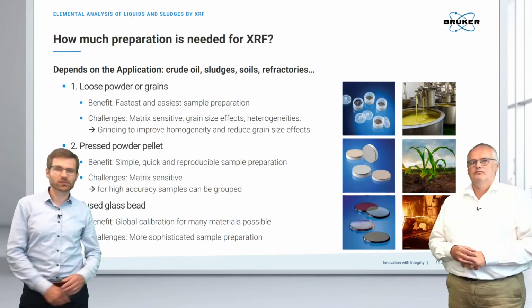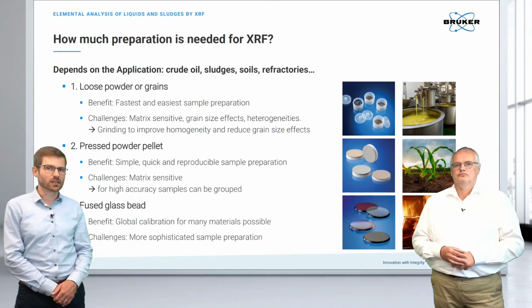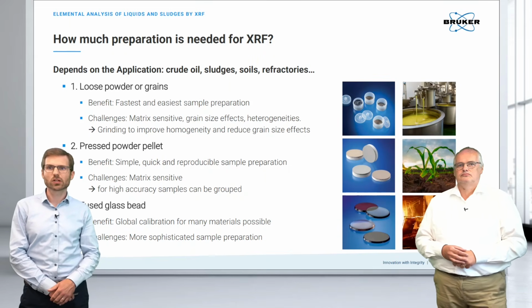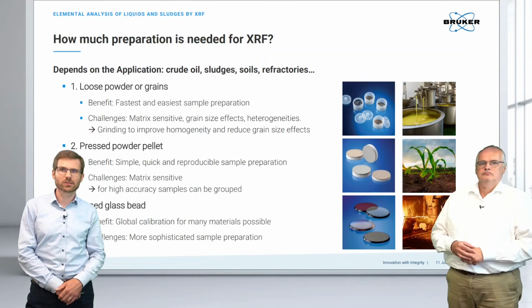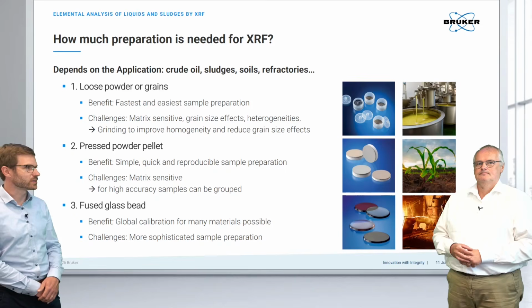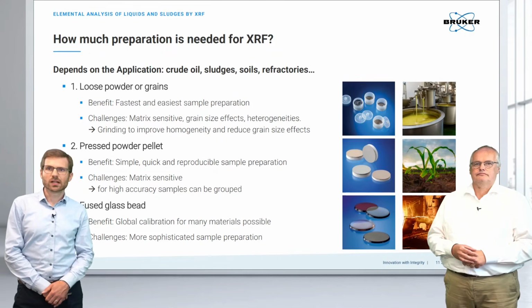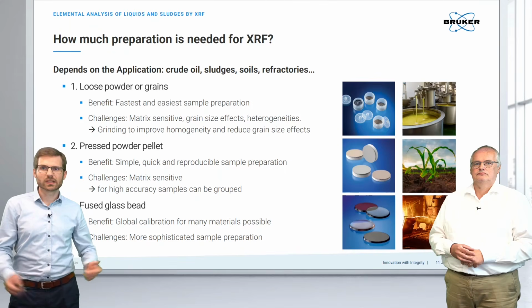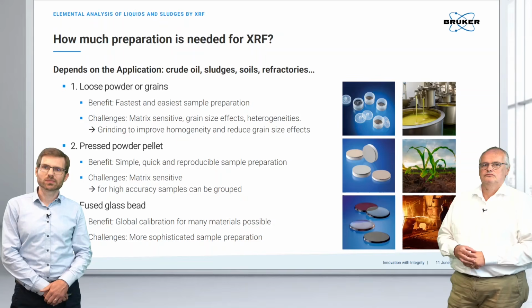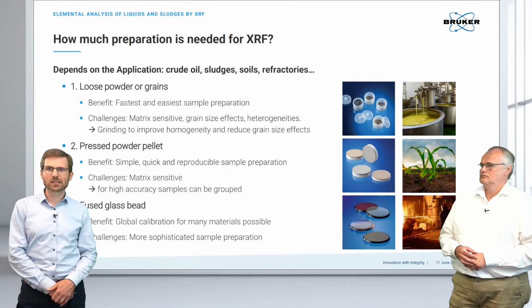Exactly. Well, Kai, thanks for the technical introduction. Now let's talk a little bit about samples. Like you said, today's webinar is about more complex samples, heterogeneous samples, so to speak. Can be crude oil, sludges, maybe soils, anything that's coming maybe from recycling, environmental. However, in any case, there are always the same ways to present a sample to an X-ray device, and this is depicted here on this slide.